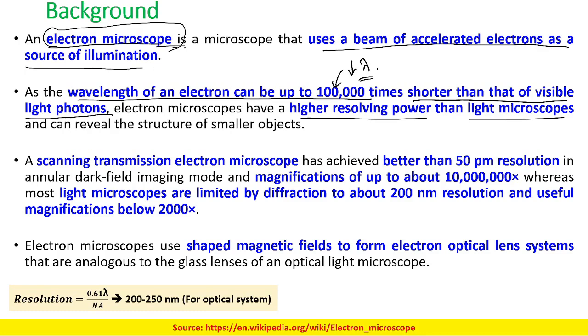Even the detectors, when we talk about a color camera: how does a color camera work? Any idea? The sensors for detecting an electron beam and a photon are both CMOS cameras or other semiconductor devices or CCD cameras. So what makes a color camera a color camera? In color cameras, we have R, G and B color filters, and these filters are so small, arranged in a particular way. I am not going into the construction of that.